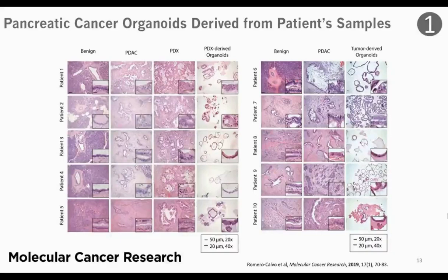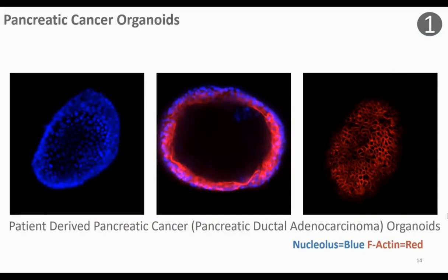Here are some images of pancreatic cancer organoids from my own data — specifically, patient-derived pancreatic ductal adenocarcinoma organoids. Like the ducts of the pancreas, you can see that the organoids are hollow on the inside. Unlike monolayers or 2D structures, organoids are 3D structures. To fully image them, we take different Z-stacks or image slices. These are fixed and stained — the blue is our DAPI stain or nucleus stain, and the red is phalloidin stain, or F-actin.